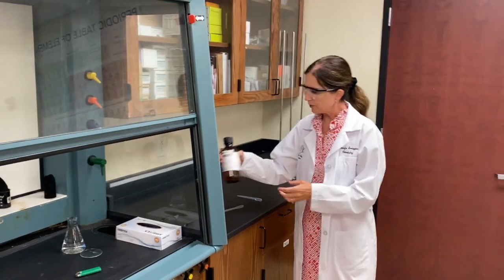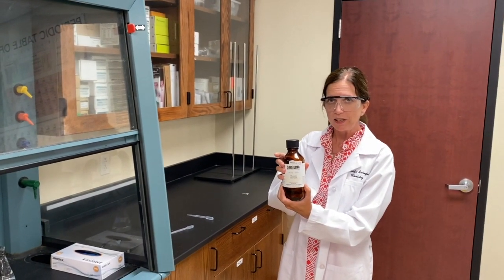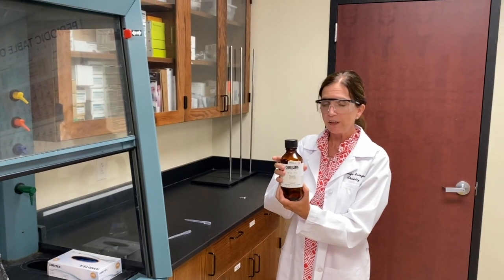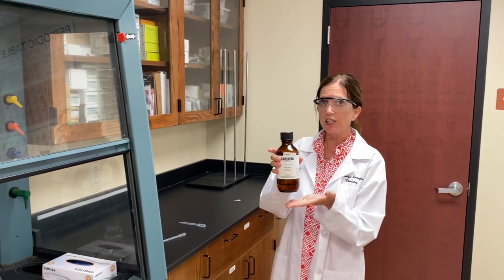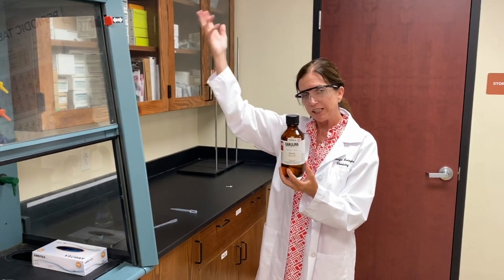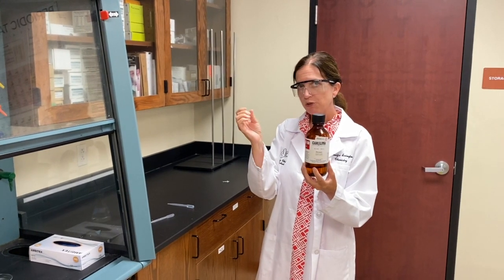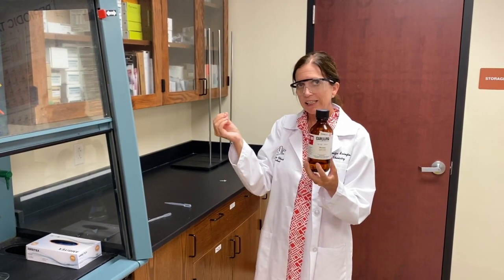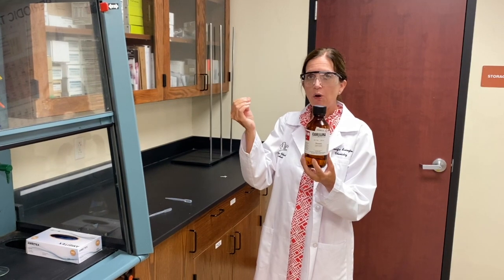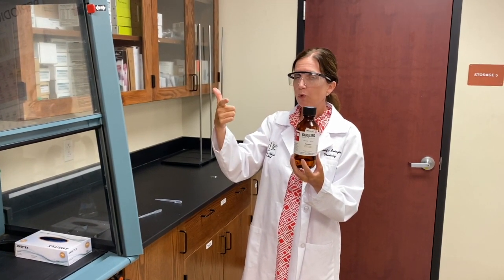So what I'm going to do is take some hexane — hexane is a volatile liquid. It has a very high vapor pressure and low boiling point, which means when you open this bottle, all the vapor is going to come out and you're going to smell it. When you use nail polish remover, that's basically acetone, and that also has a very high vapor pressure and a very low boiling point.